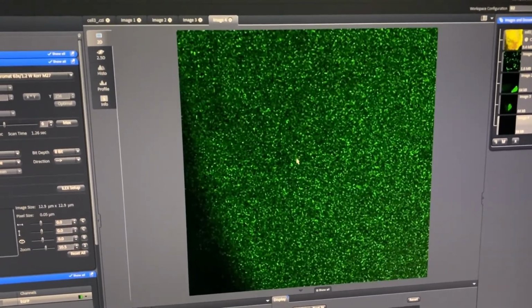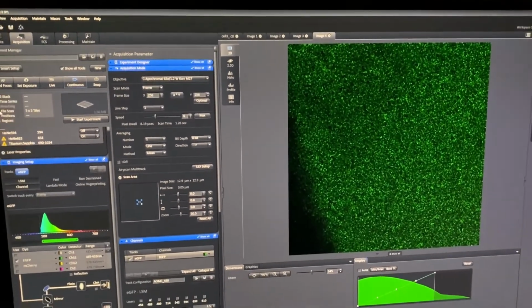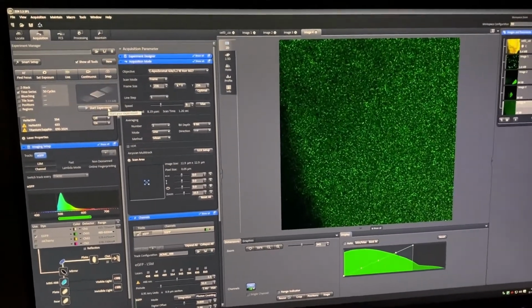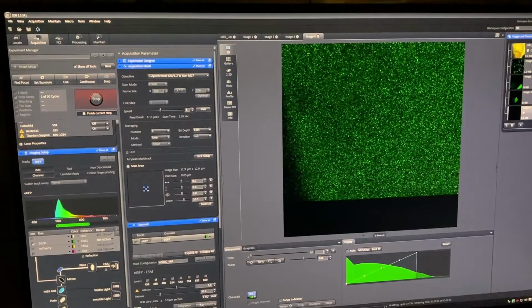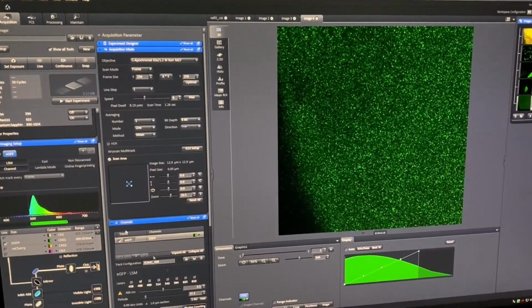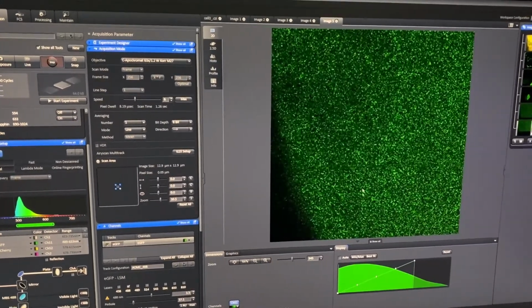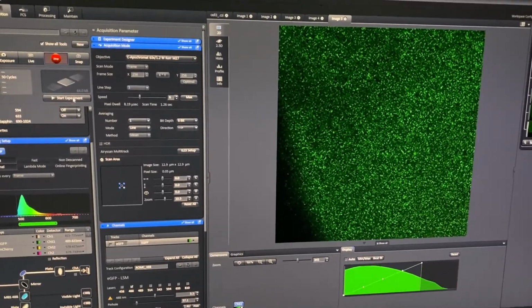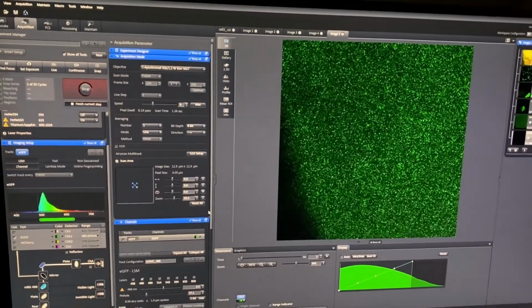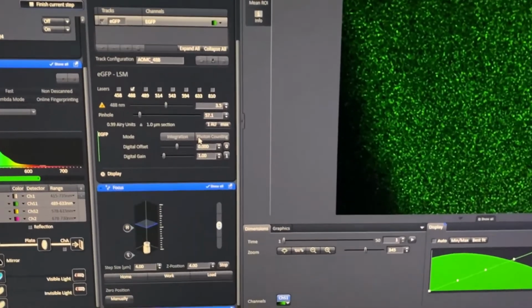And now what you will see me do is very quickly record this for 50 cycles and try to get the diffusion coefficient of this cell. So parameters adjusted, and now start. Another important point to mention here is that I use photon counting mode to do my analysis.